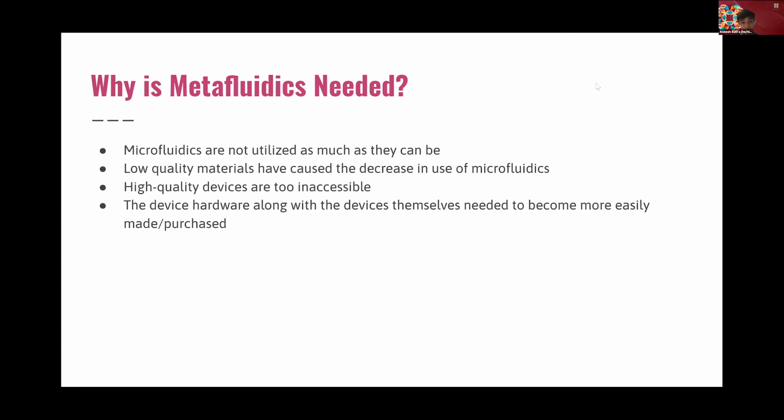Because the low quality devices were more accessible since they were cheaper and easier to manufacture, the high quality devices became inaccessible and people started completely throwing away microfluidics themselves due to only the low quality devices. And since the low quality devices were proving that microfluidics needed an upgrade in the availability of high quality devices, Metafluidics was created.